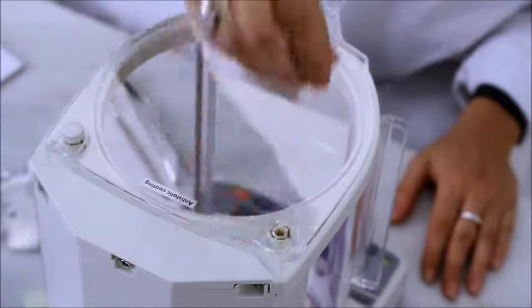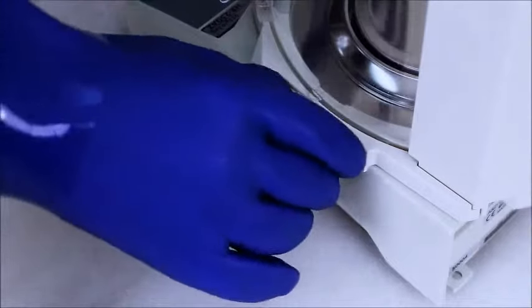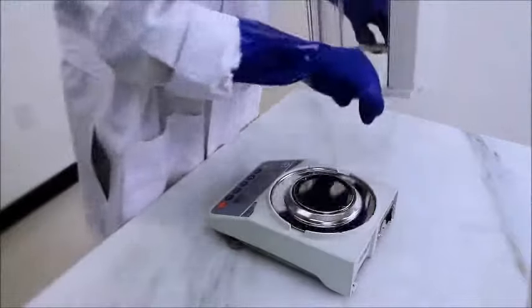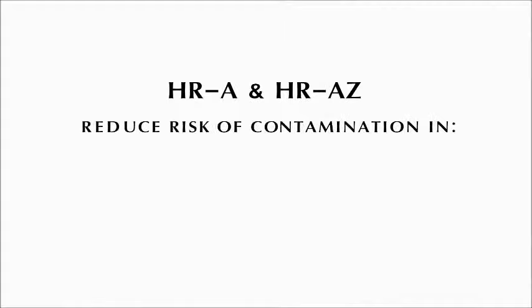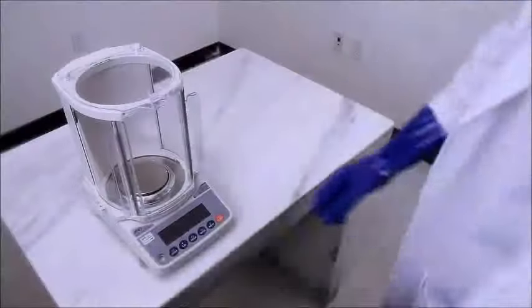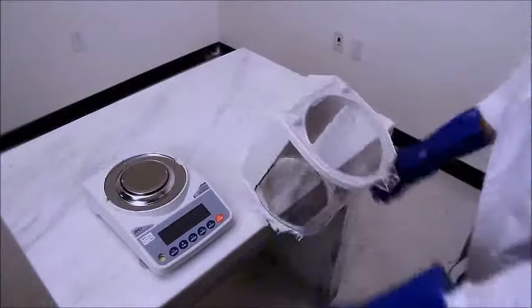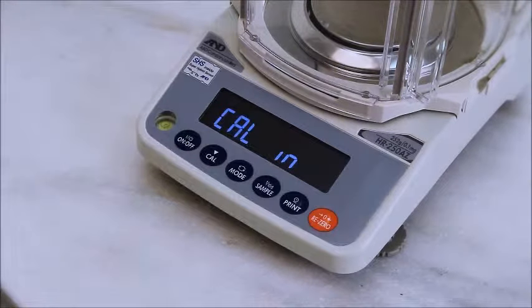The anti-static breeze break increases measurement accuracy. And it's easily detached, even with heavy gloves, to save you effort when cleaning. The HRA is safe for sensitive environments, such as pharmaceutical and food applications. The shatter-proof breeze break removes a common safety and contamination risk from the lab or production area. The HRA-Z also saves time with built-in calibration.